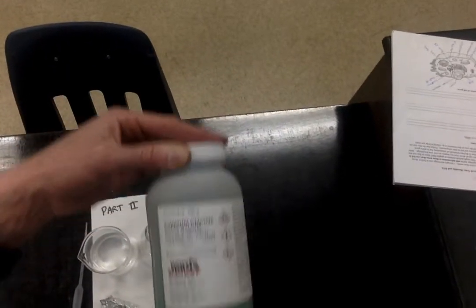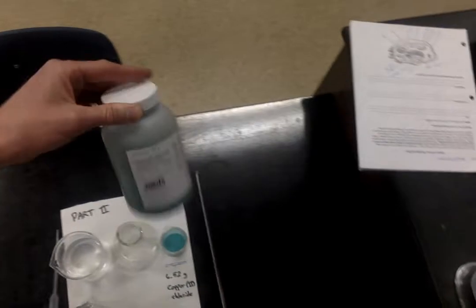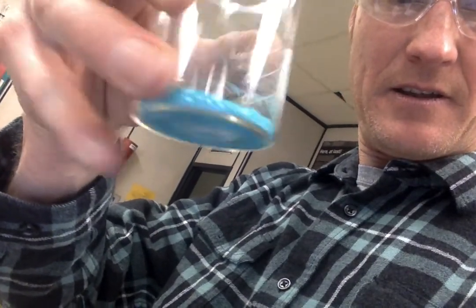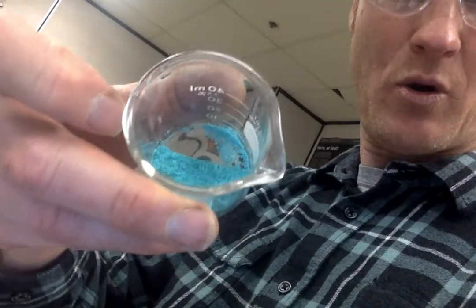This is the copper chloride ingredient. I have a thermometer for this one as well. We're going to see what happens. Let's have a closer look at the crystals there. These are the crystals of the copper chloride.